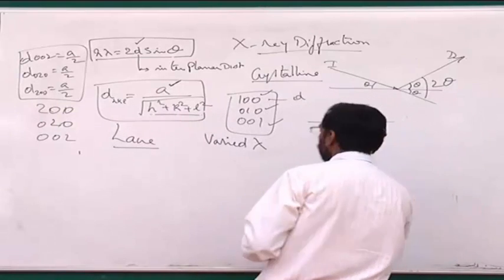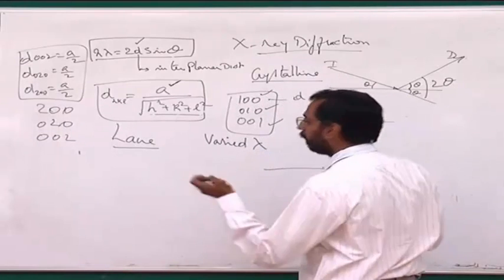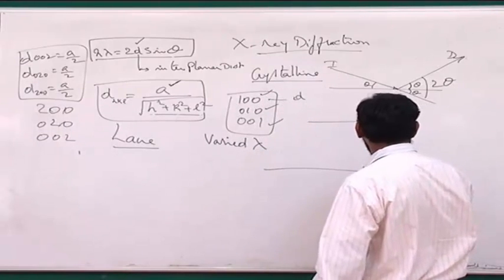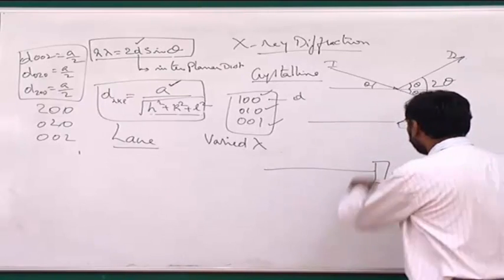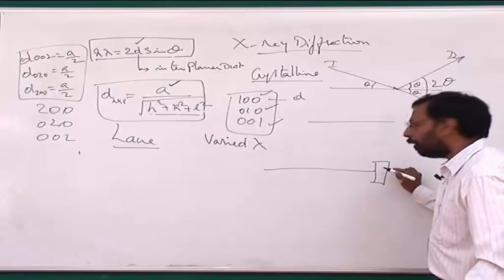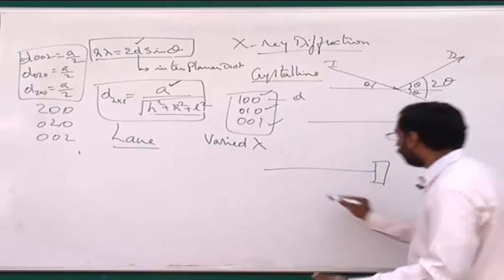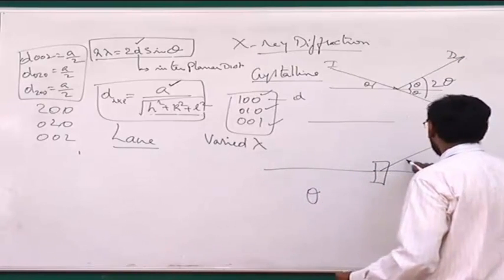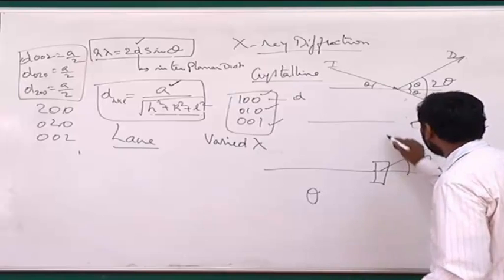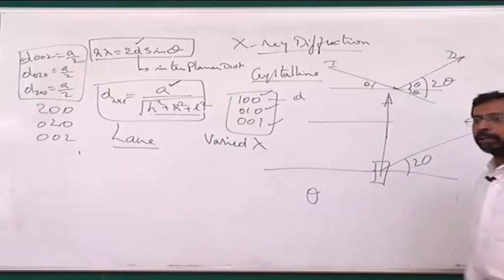of course in this people also use what is called back diffraction, back scattered. For example, if you have a sample here, if the HKL of the sample which is getting diffracted is such that the 2 theta is equal to 90 degrees, then the beam will go like this, right, the diffracted beam.